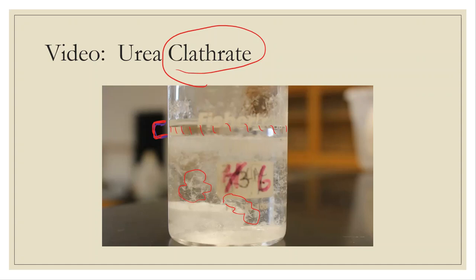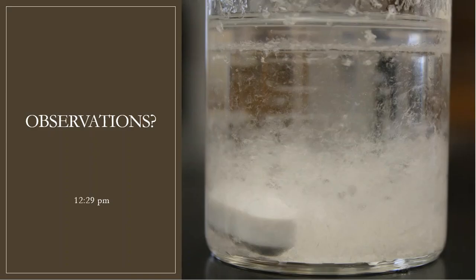And when it surrounds those alkanes, it is forming a cage around them, and it's trapping them, and it's pulling them out of solution. And that is the presence of the white crystal that's very long and needle-like that you're seeing in this image.